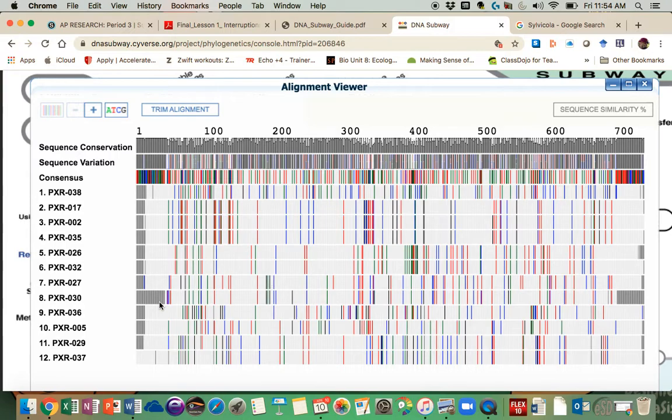So you can decide based on what these species are. I would keep a running list on a table or on a piece of paper that identifies the species name to help you interpret the data. So O38 is what species, O17 is what, and then also consider the locations that you caught them from, right? So that's some of the things that you want to present in your findings.